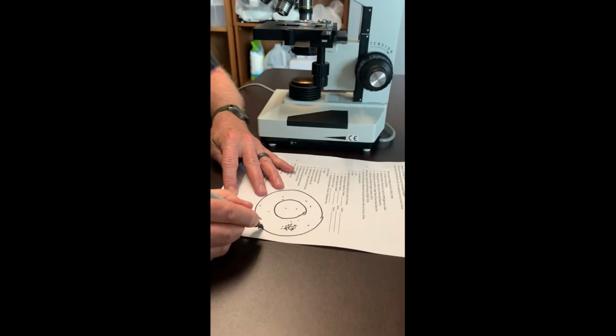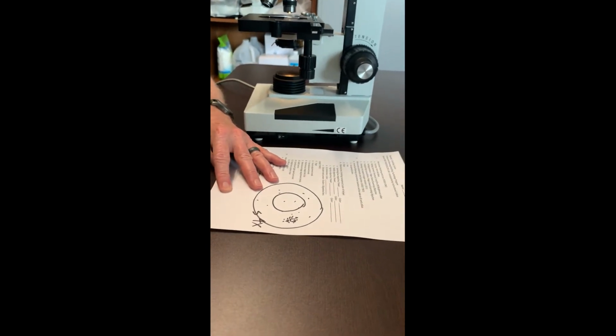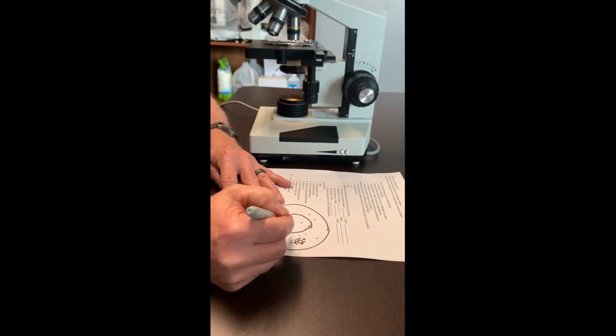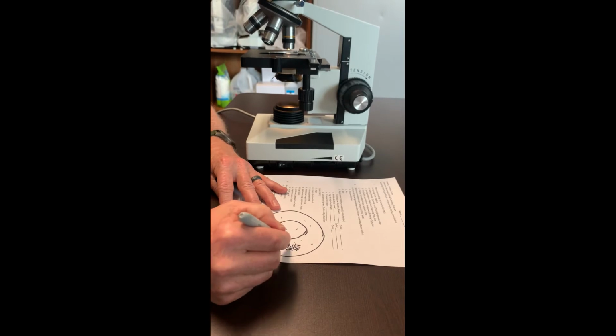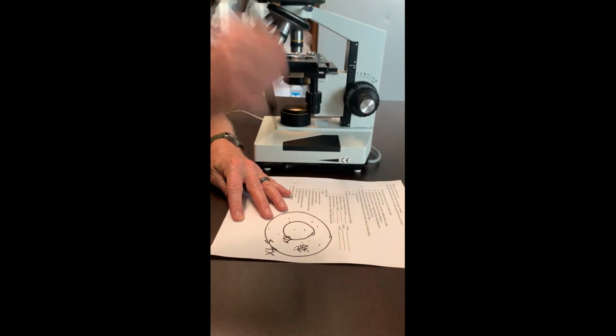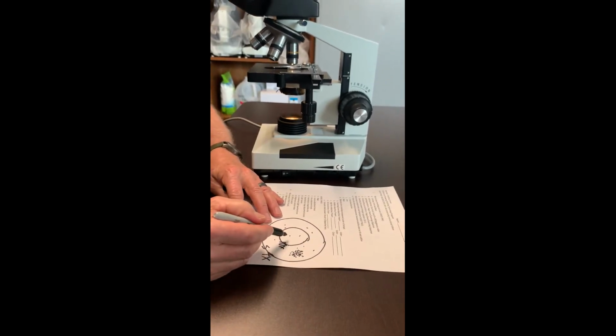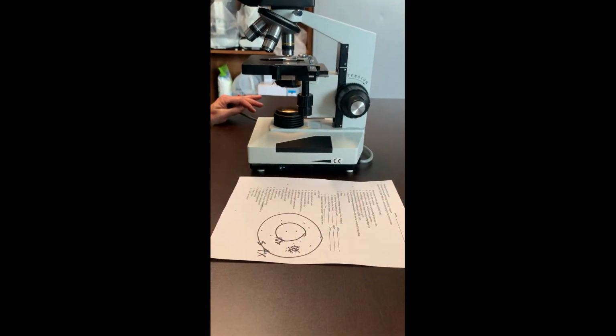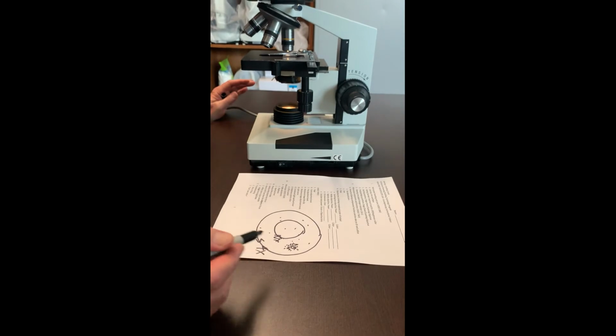There's my 4x lens. Now here's my 10x lens, and there's its field of vision. If my object was over here to the side, and now I've gone to a higher power, and I'm going, where'd it go? Where'd it go? Well, it's now out of your field of vision.